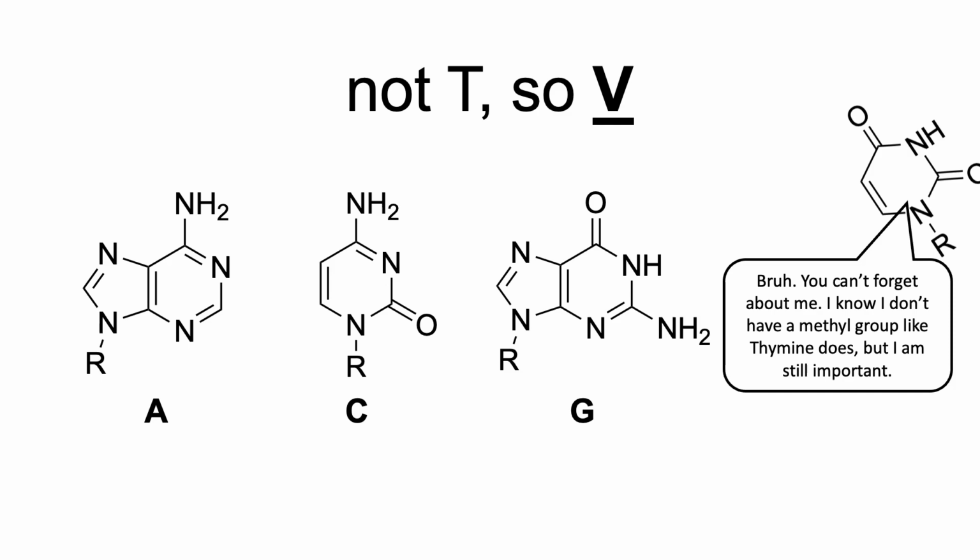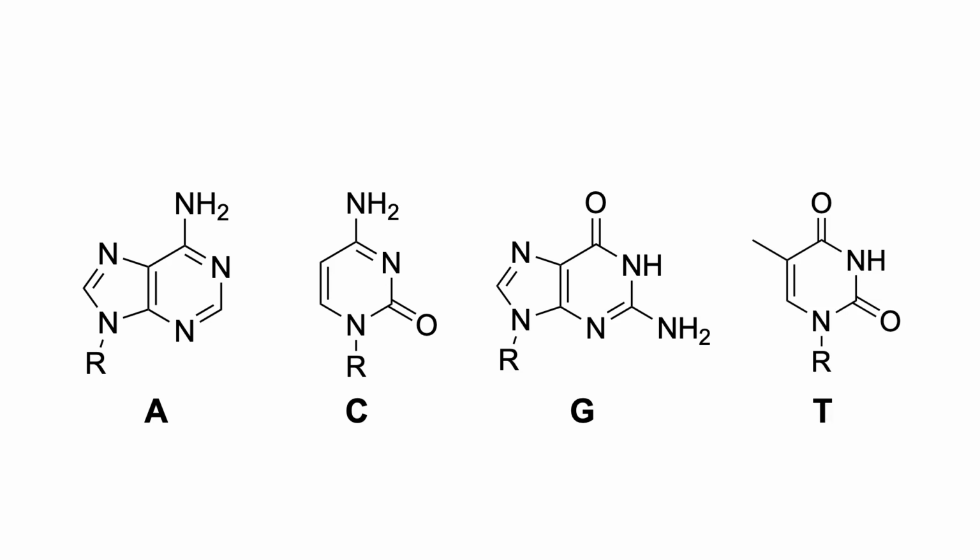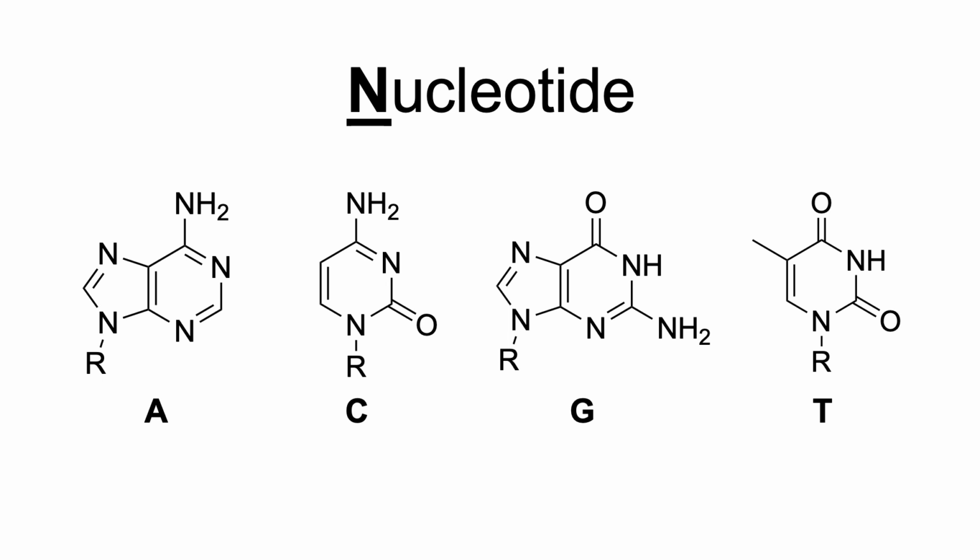Okay, good. And then we might have a case where it's any one of the 4 nucleotides. So with this, we just denote it with N for nucleotide.